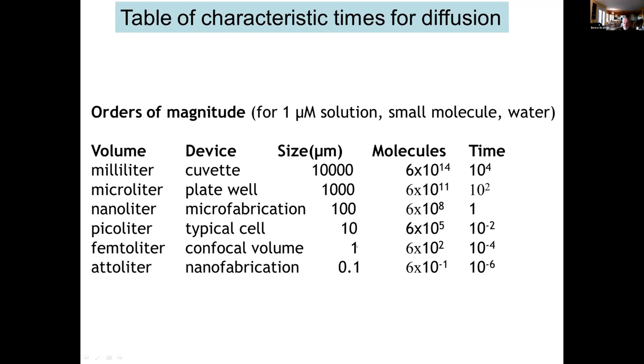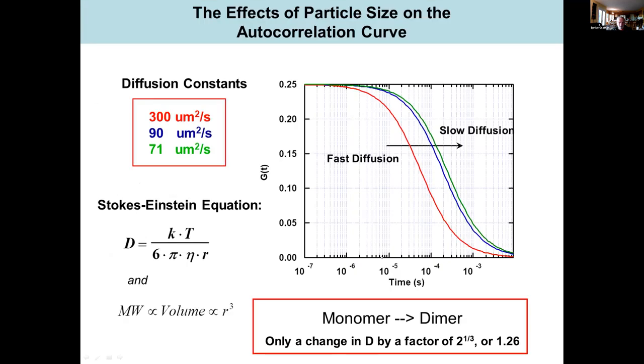So you see that this quantity and this quantity is what makes the experiment difficult. And after this experiment, it took about another 30 years or more to figure out how to make a very small volume and how to measure a very fast time. So you need a fast detector and a way to measure a small volume.